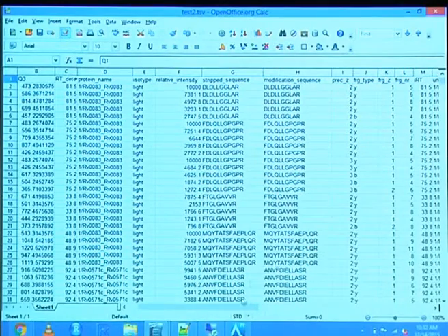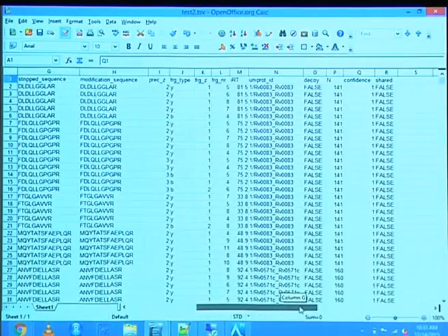So there you go. This is useful, particularly for the human library since it has over 140,000 assays. So it can make your life a bit easier. I will show you issues that you will run into if you only use that few assays.